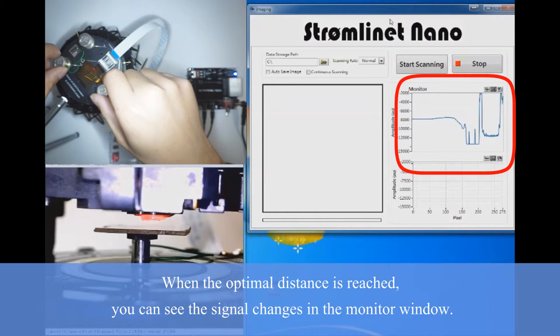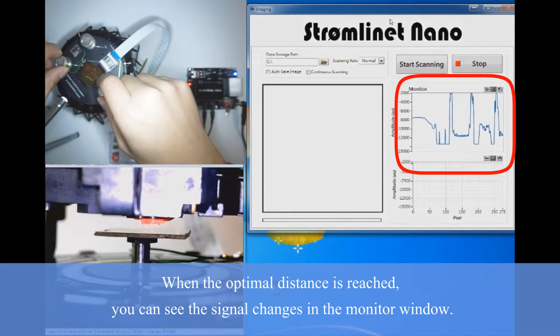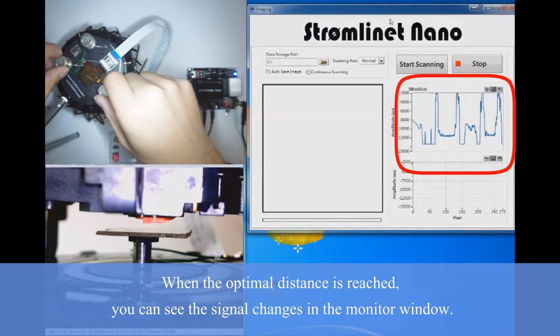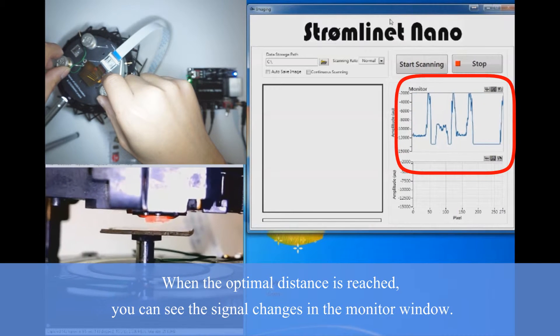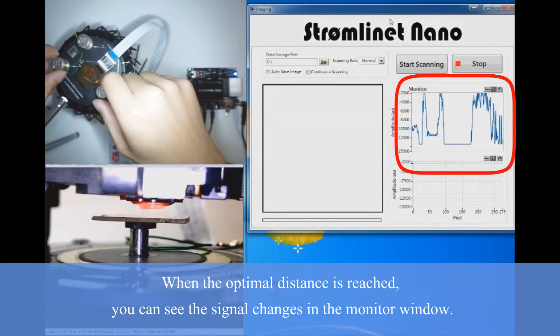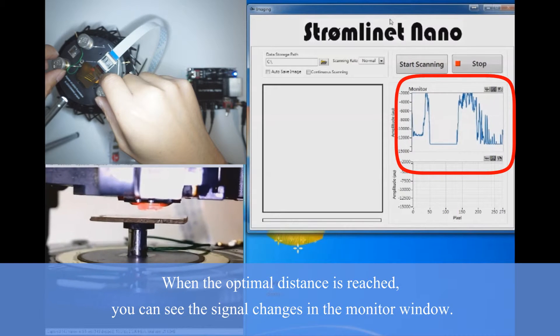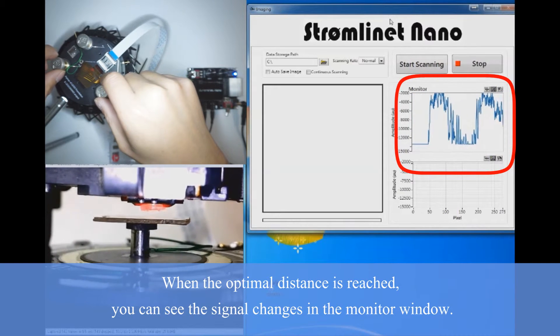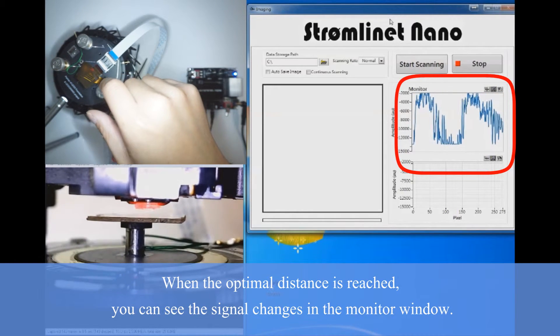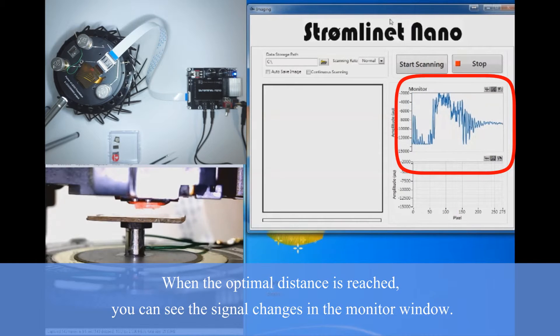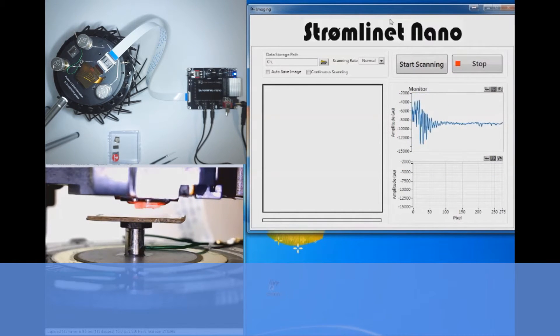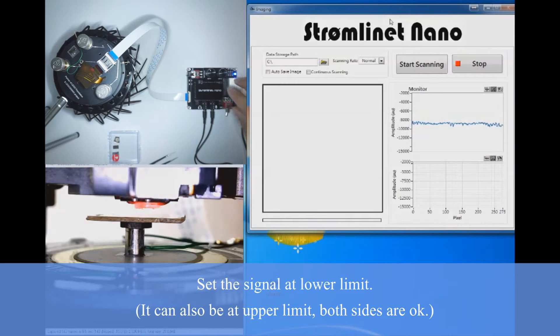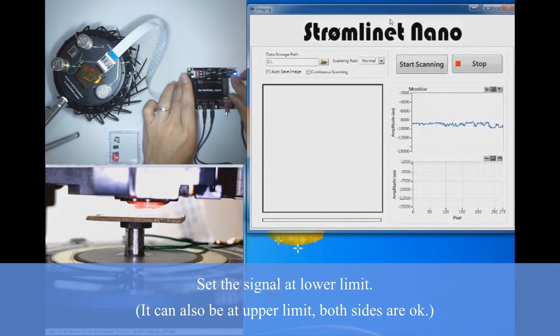Once we're almost there, the monitor amplitude signal will change. For optical profiling mode, it's OK to simply set the signal amplitude at either limit. But just for fun, we're going to try to set the signal amplitude somewhere in the middle between the two extremes.